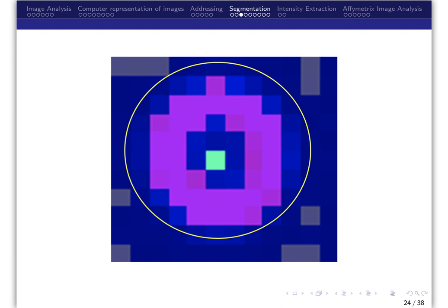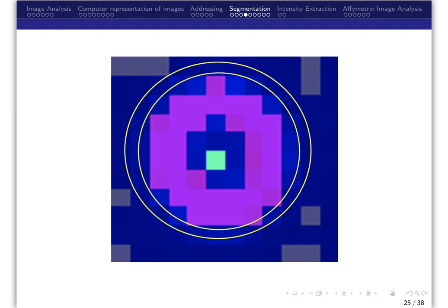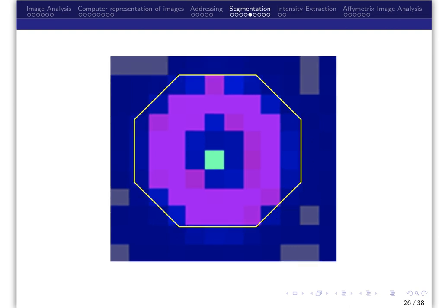Here's an example of a spot patch, which is the full rectangular region where you can see somewhat of a circular spot within the spot patch and the individual pixels comprising this. There may be hybridization issues that affect the spot intensities, such as dust particles or contaminants that artificially contribute to signal intensity, or fragments of the probe may be inadvertently placed outside the circle yet counted as background. Some circles or spots may be smaller or larger than others. The spot could also take a different shape.